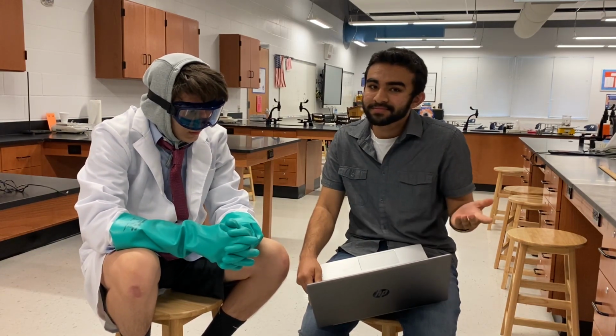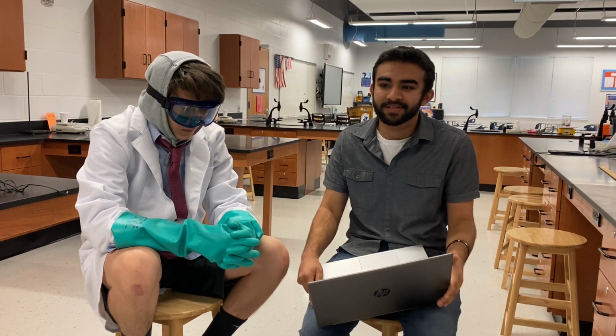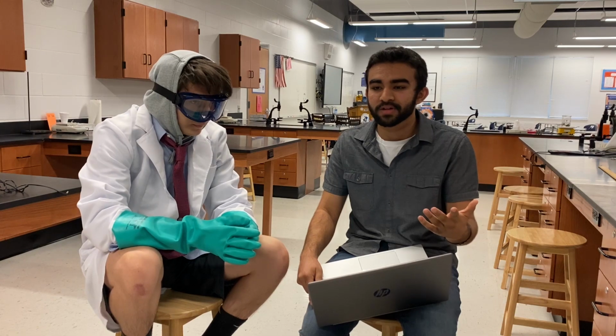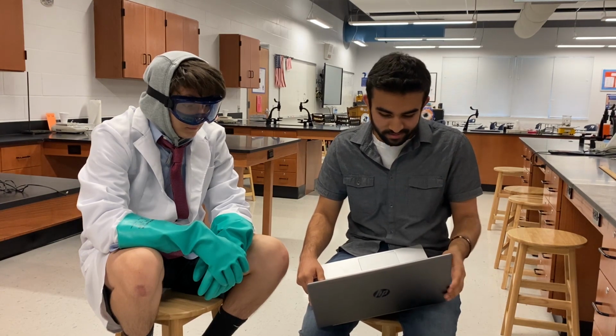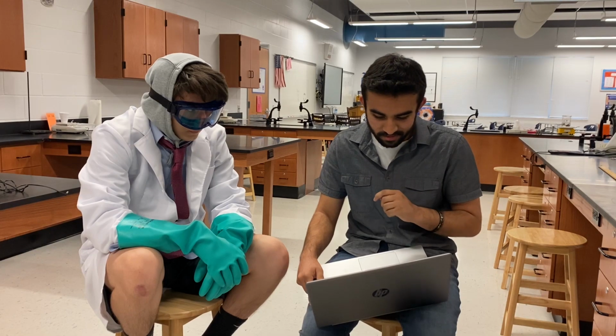Okay. Horseplay. Bad idea. Don't want to break anything, or else that's expensive. Plus, you could get cut. And in the event that you actually do have broken glassware, you would want to tell your instructor, because that would be paramount in this situation, since they would know what to do.